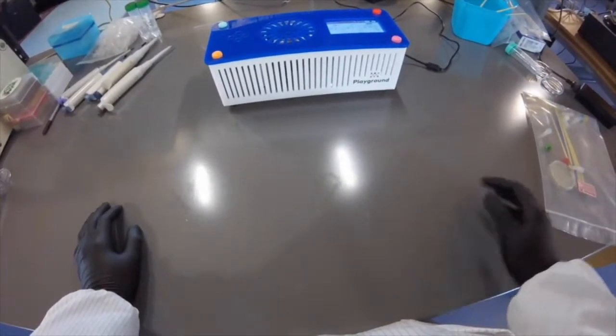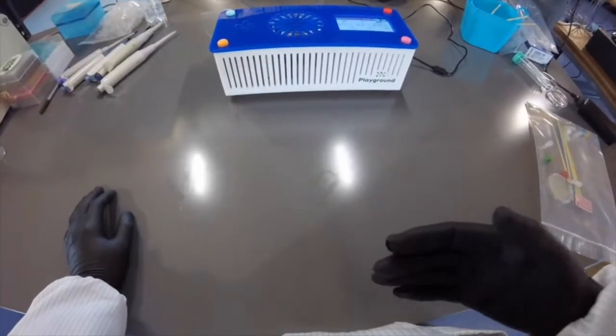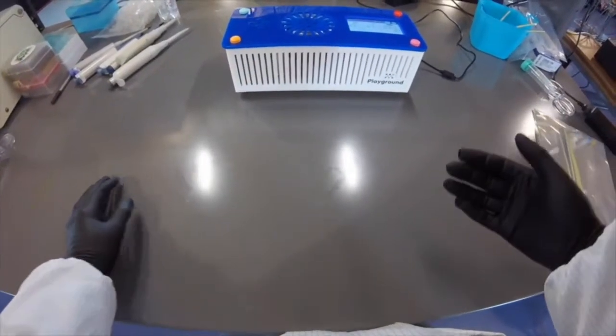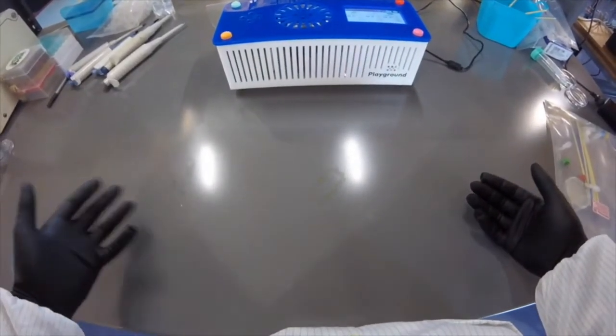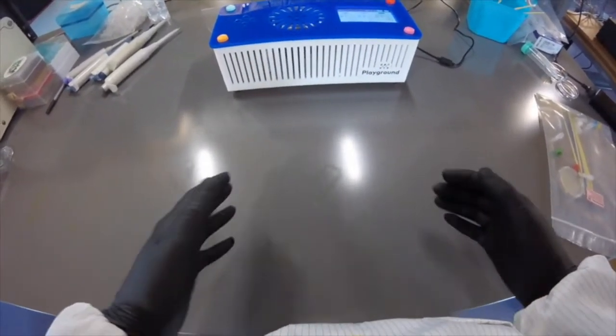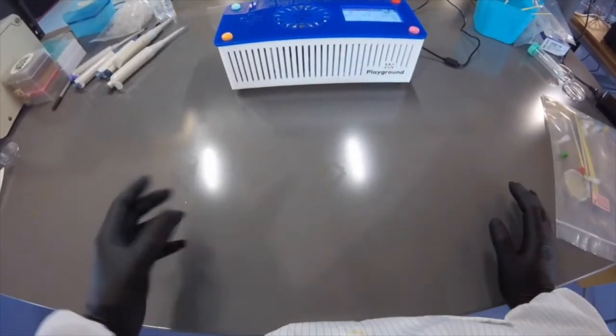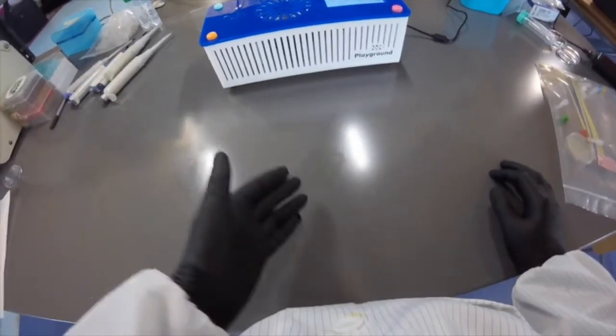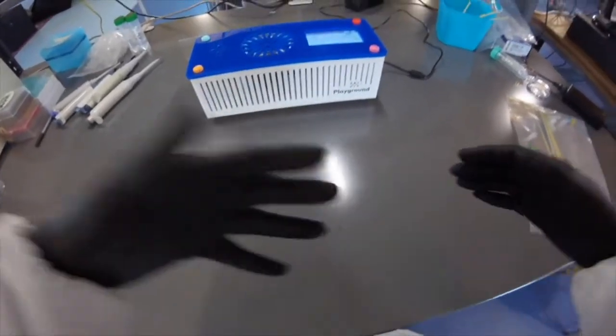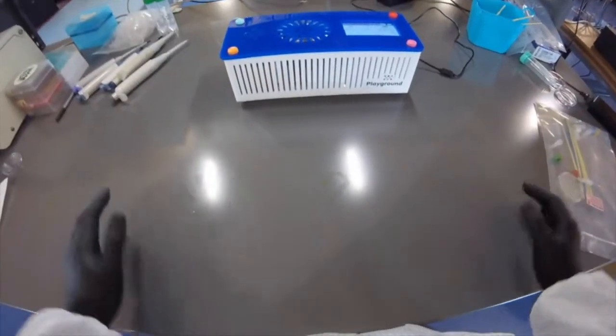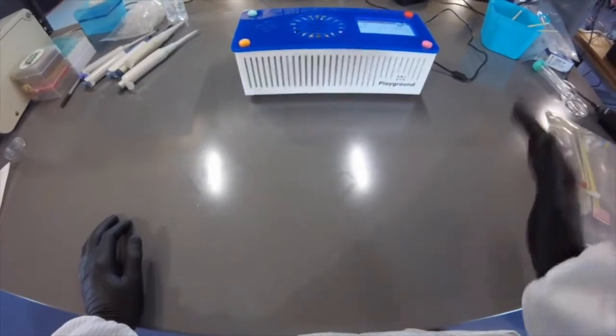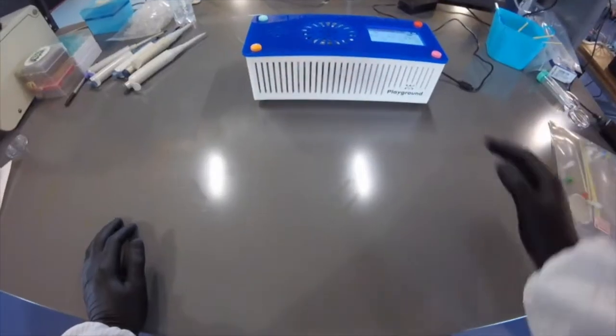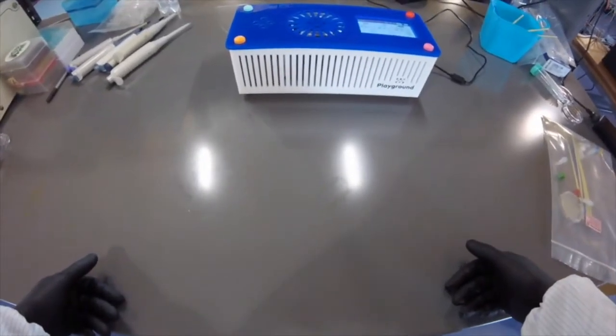I did that because at cool temperatures cells will often create the pigments more. The way the DNA program is made is that when the cells are really trying to grow fast, the program doesn't work so well. Once they start to slow down and go into what's called stationary phase, that's when the program really kicks up. By lowering the temperature to 30, they slow down and start really activating the program.